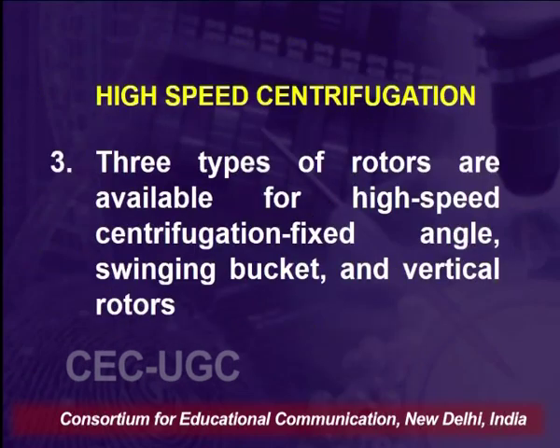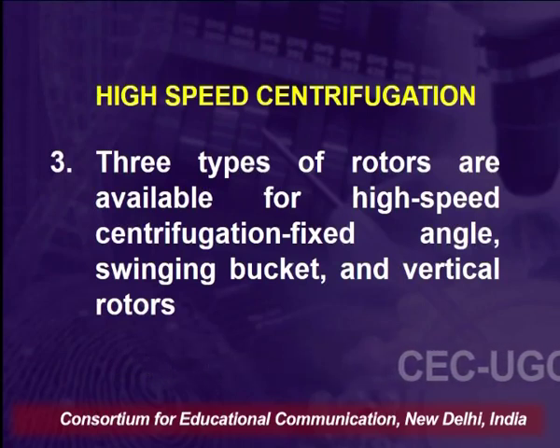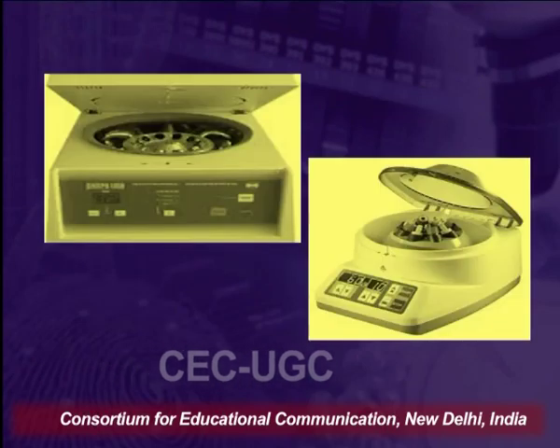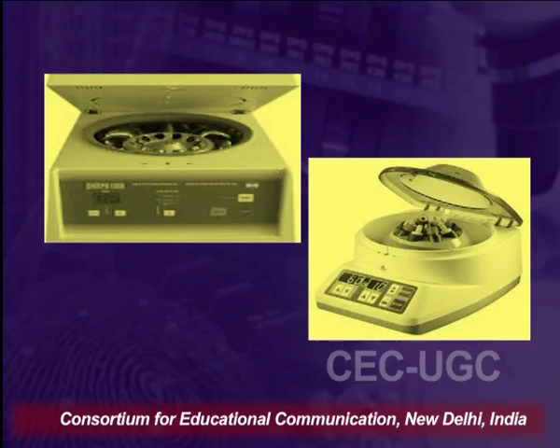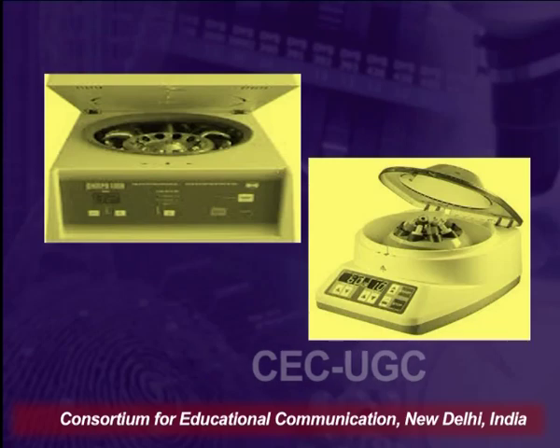Usually the rotors involved in high speed centrifugation are fixed angle, swinging bucket and vertical rotors. If the rotor is at an angle, it is a fixed angle rotor, and if it is not at a fixed angle, then we call it a swinging bucket.